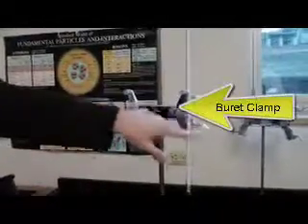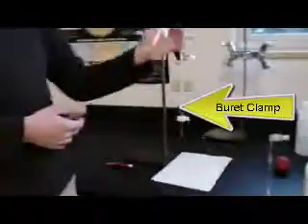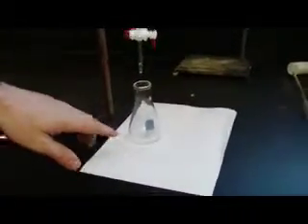Okay, you'll notice it's on a little stand here. It's called a burette stand, burette clamp. And you'll usually be dispensing this into an Erlenmeyer flask. You've used lots of these. You'll also notice I have a piece of white paper underneath the reaction. This is so you can see the color change take place, because when we use the acid-base indicators, we have a color change, and that tells us when we've reached our endpoint.